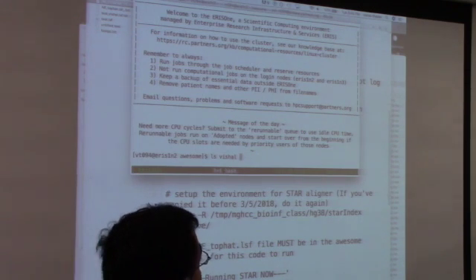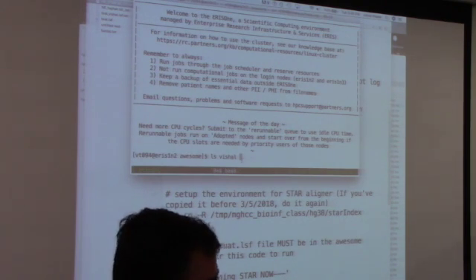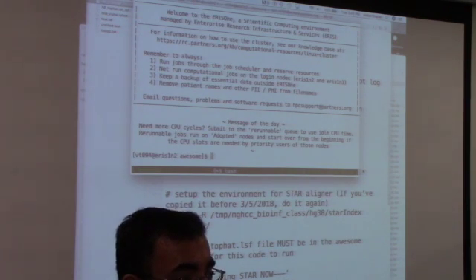And that's what it was. So look, it brought me back to exactly the place where I left it. Okay? So let's say, once it copies, I would highly recommend that before you start running your program, you start using screen and then run the rest of the commands.